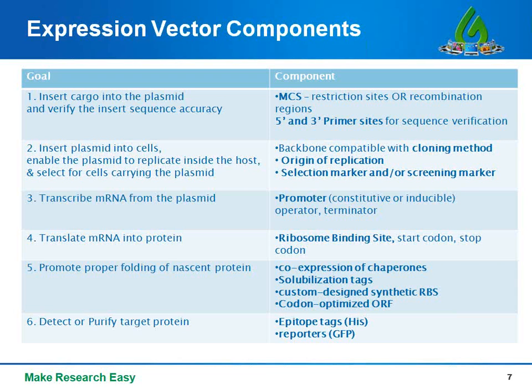So then after you insert your cargo, or really any time you acquire or modify a plasmid, you'll want an easy way to verify the accuracy of the insert sequence. So most vectors include common sequencing primer sites such as T7 and M13, flanking the MCS. Most DNA sequencing services will offer primers for those sites at no cost, whereas if you need a custom primer, it'll cost more. So you might look for 5' and 3' primer sites just for convenience for sequence verification.